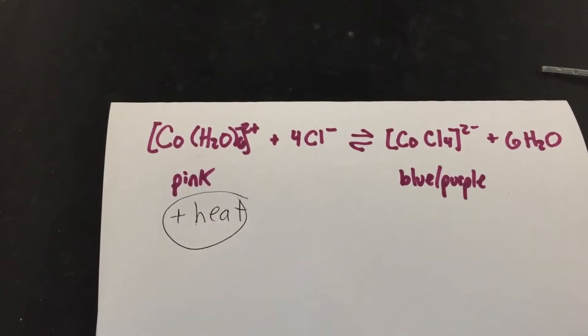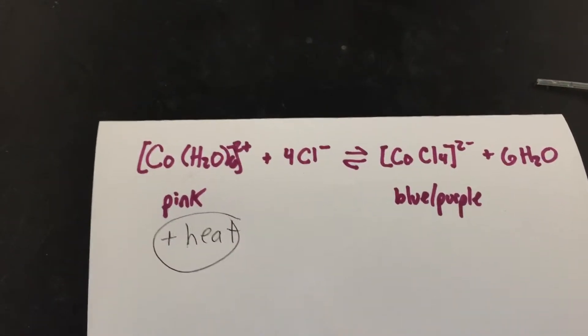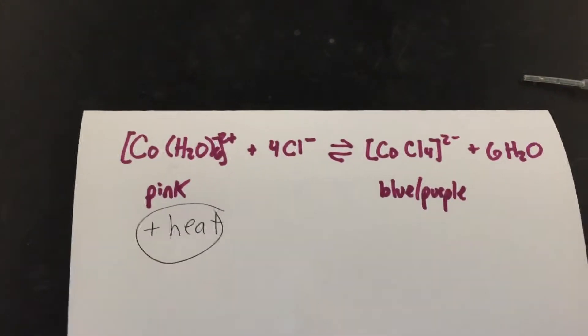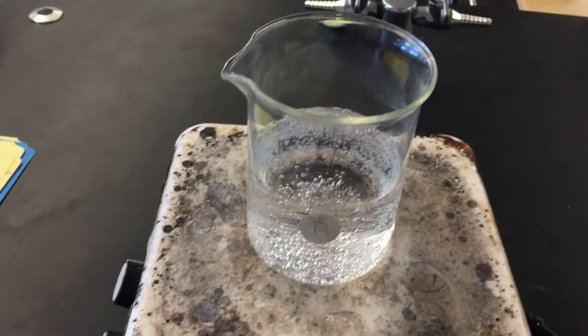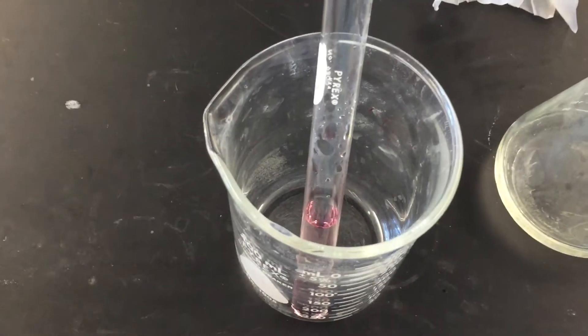If I decide to heat this up, my equilibrium is going to shift again. What I have over here is almost boiling water. I'm going to add my complex and see what happens.